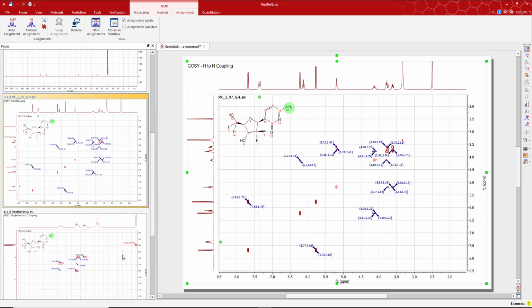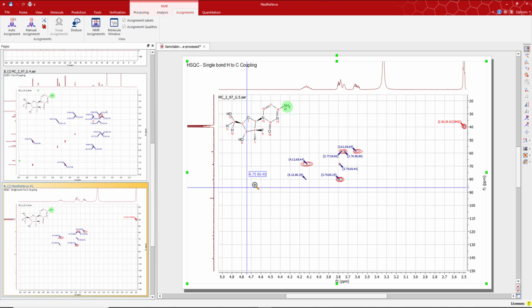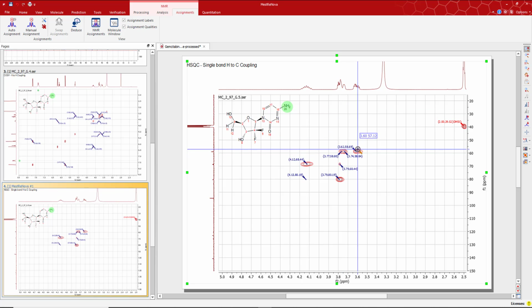So we're going to go back to the HSQC, we're just going to double check. So the more downfield side of that overlapping set of signals is a 1H on some carbon somewhere. We don't know yet, but we know that the more upfield side of that signal, going by this, and then this 1H multiplet over here are our diastereotopics, because they are the only two protons on a single carbon, this carbon here at about 58 ppm.